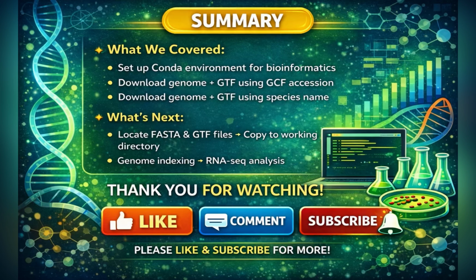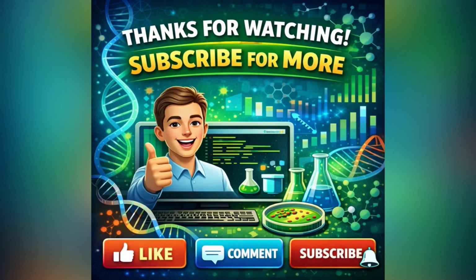Let's quickly summarize what we learned in this tutorial. First, we created our Conda environment and installed the NCBI datasets command line tool. Then, we verified the installation using the datasets version command. After that, we downloaded Genome and GTF annotation files using a GCF accession number directly from NCBI. Next, we performed the same genome download using the species name, such as Aedes aegypti, which is useful when accession numbers are not known. We then extracted the downloaded files and explored key outputs like the genomic FASTA file and the genomic GTF.